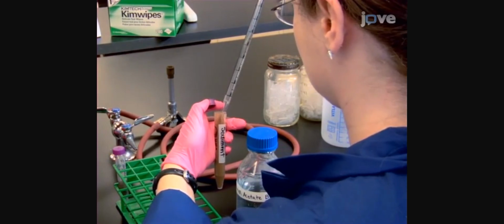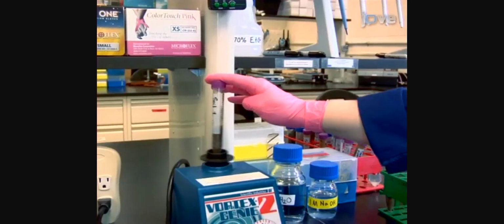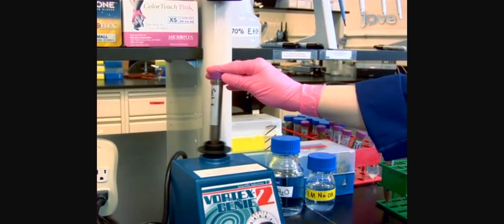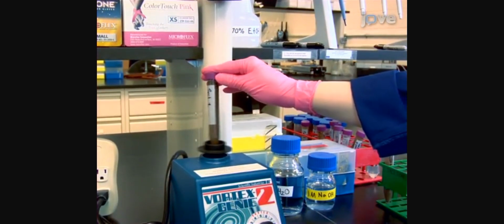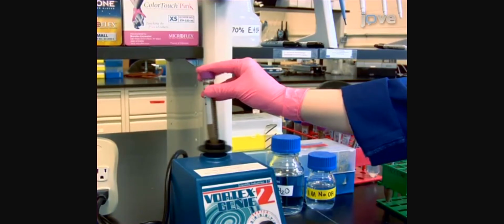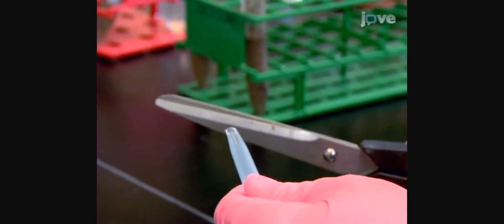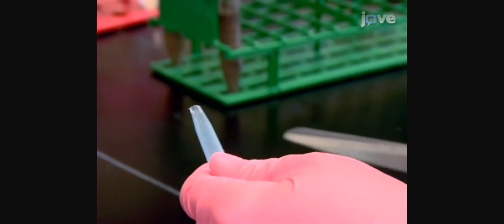The exact volume of slurry needed will vary according to the number of enzymes assayed, but a minimum of 5 milliliters is recommended. Vortex each slurry until all clumps of soil or sediment have dispersed, and note the final volume. Clip the end of pipette tips with scissors prior to pipetting, as soil slurries tend to clog tips.